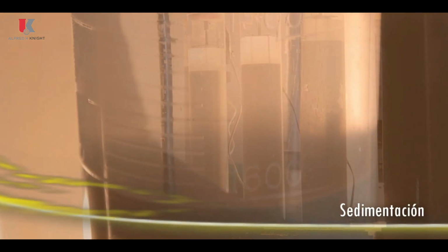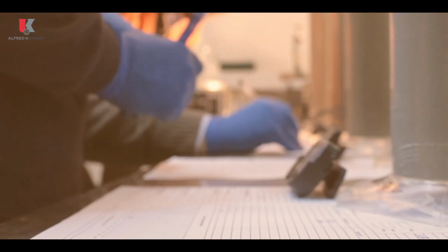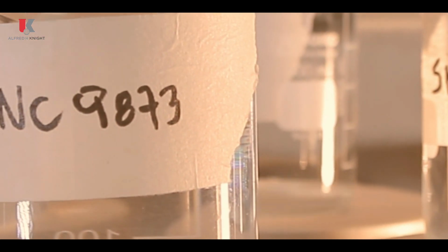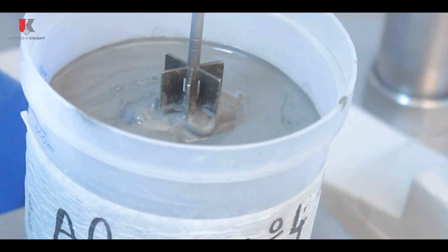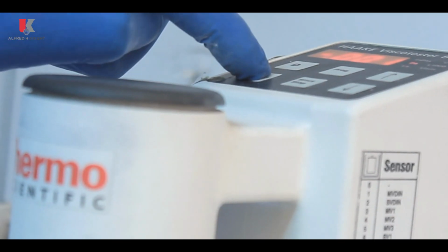Sedimentation. The objective is to obtain information for the design of conventional, high-density, high-capacity, and paste tailings thickeners. Here, different flocculants, dosages, and dilutions are tested, obtaining the optimal operating parameters and information to elaborate rheology curves.